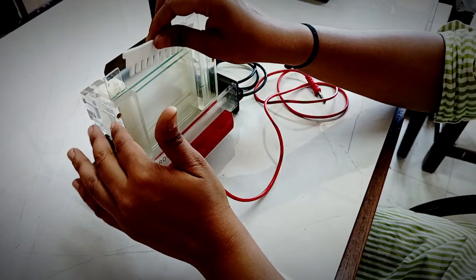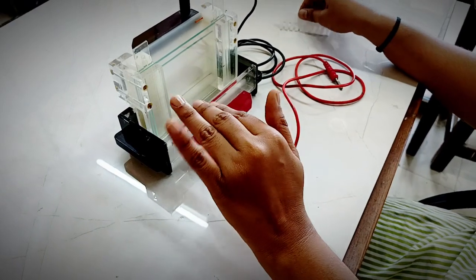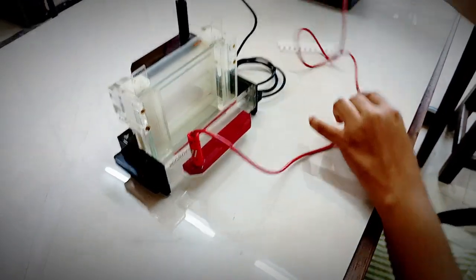you are supposed to remove the comb. The gel will get polymerized, you remove the comb, then you will load the sample and then apply these electrodes to the power pack.